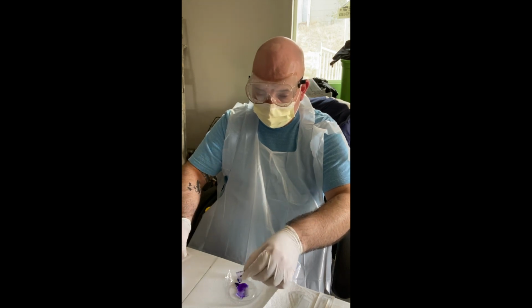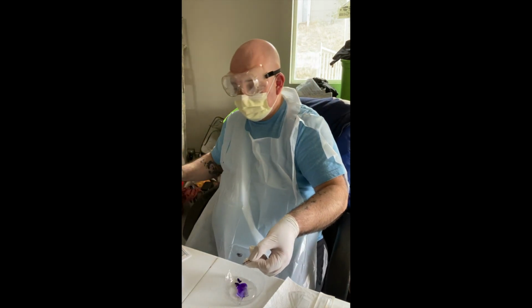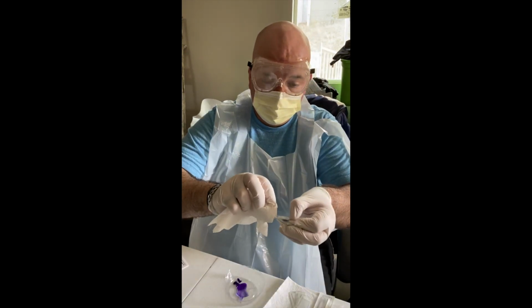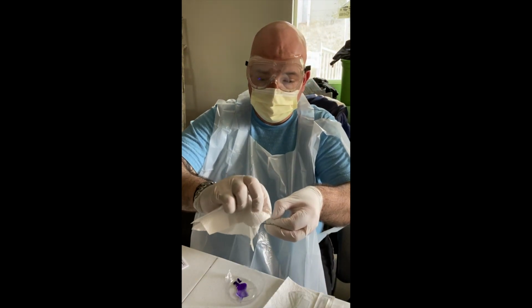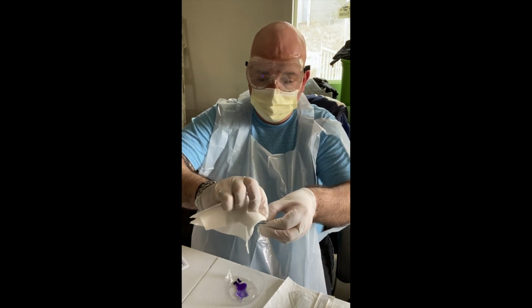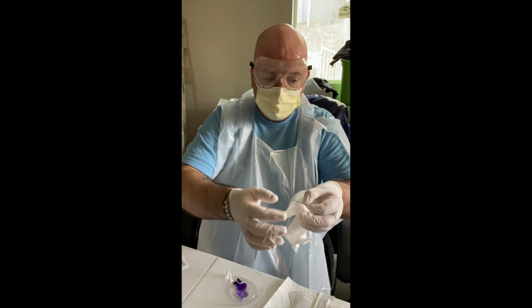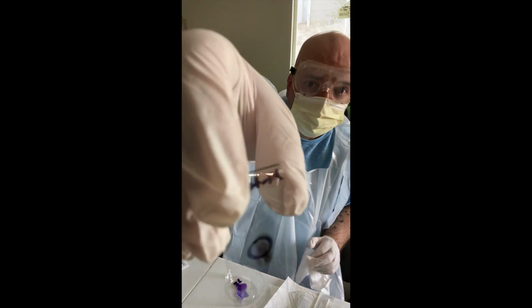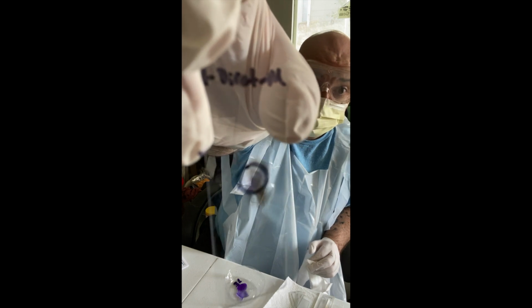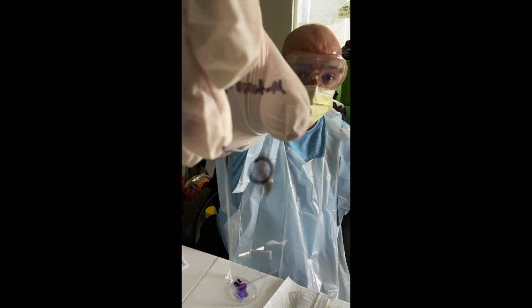Okay, so that's done. So now I'm just going to grab a paper towel and very gently dry my slide. Just blotting here, since I don't want any extra liquid on the slide, and then I'll show you in just a second. Okay, now in the center of the slide you can see a small purple coloration, and those are my plaque cells that I got from my teeth and my gum line.